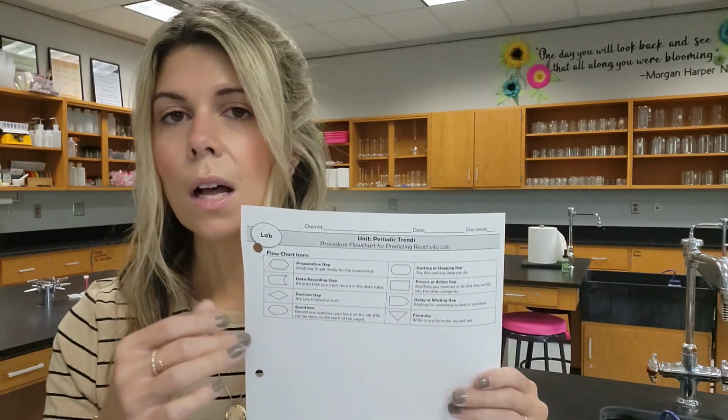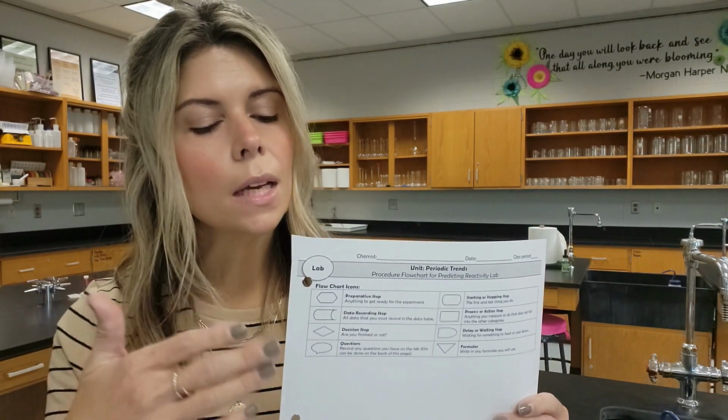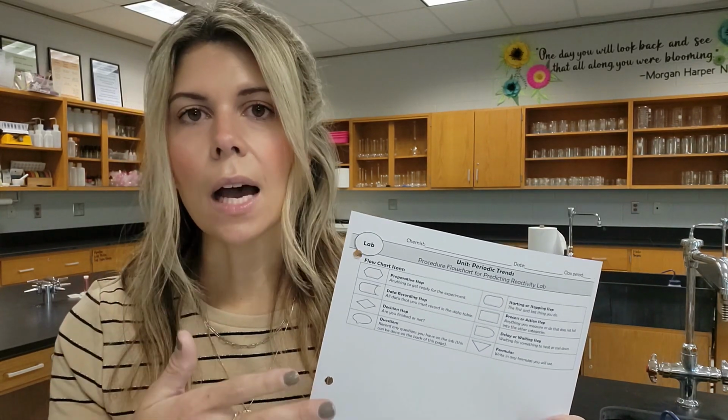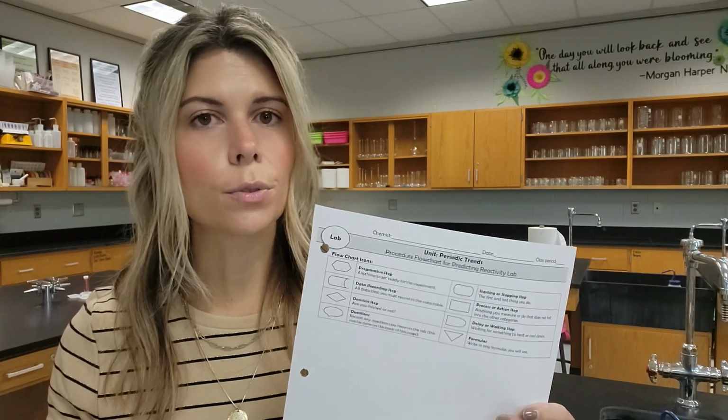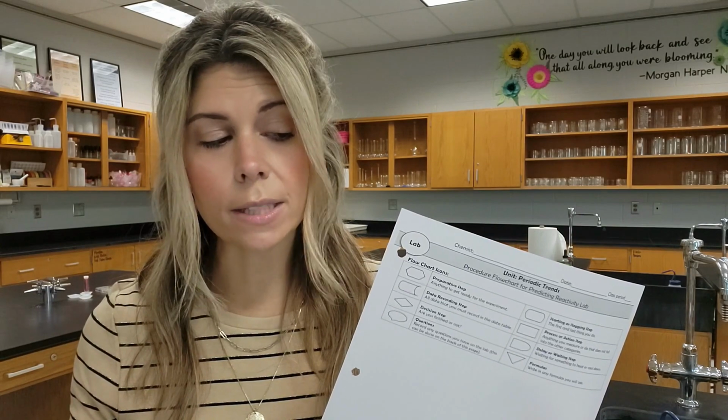So you can see there's lots of symbols here, and the students are going to be deciding what steps they want to perform in order to understand the reactivity trend down a group and across a period. And so they're going to be designing this before they actually get into the lab to complete the lab. So that's almost their ticket into the lab.